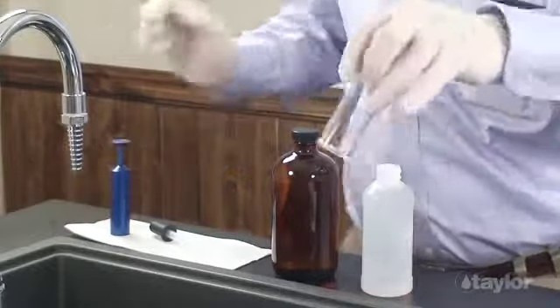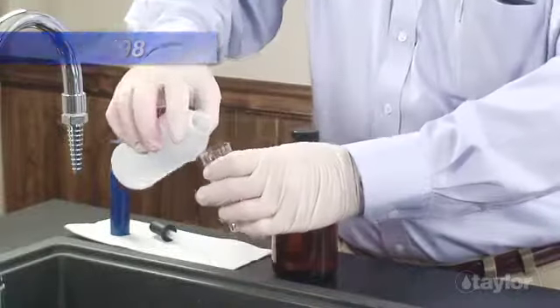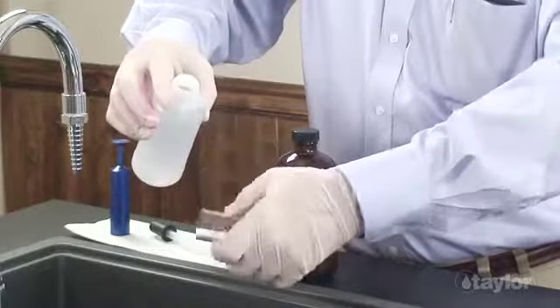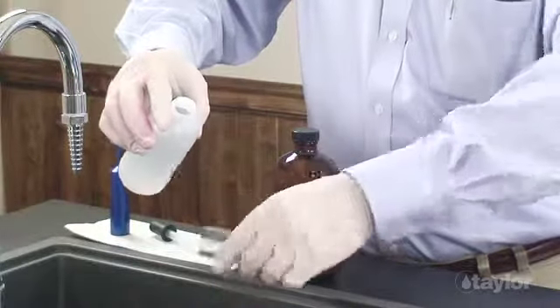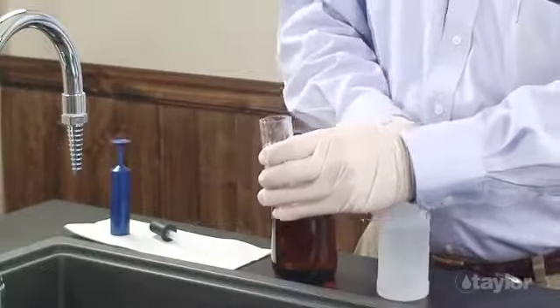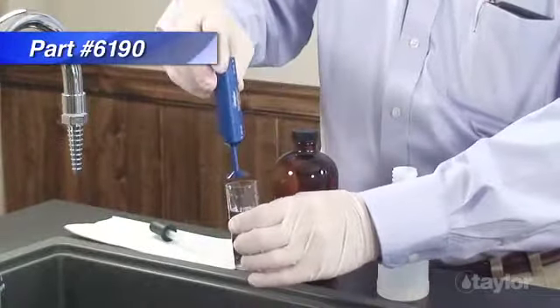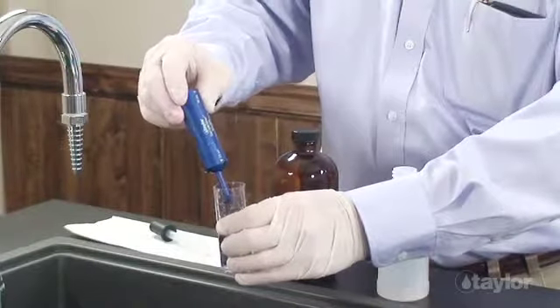Rinse and fill a 25 milliliter sample tube to the 25 milliliter mark with distilled, deionized, or molybdenum-free tap water. Taylor Sample Sizer, shown here, is a great tool for getting accurate measurements every time.